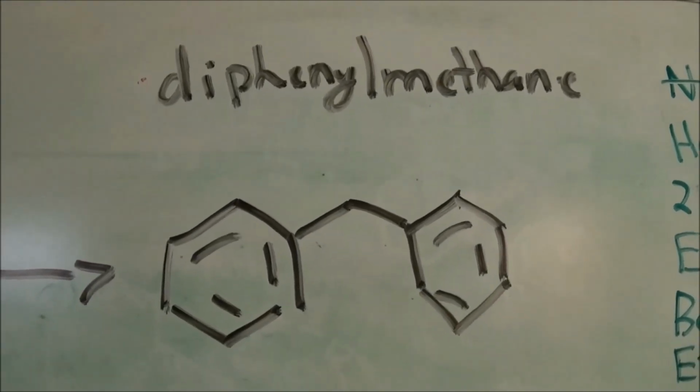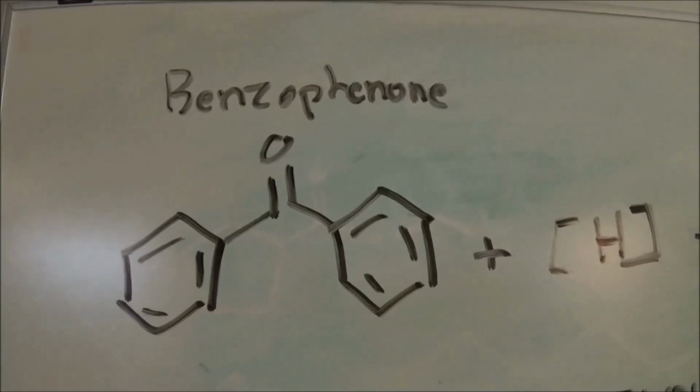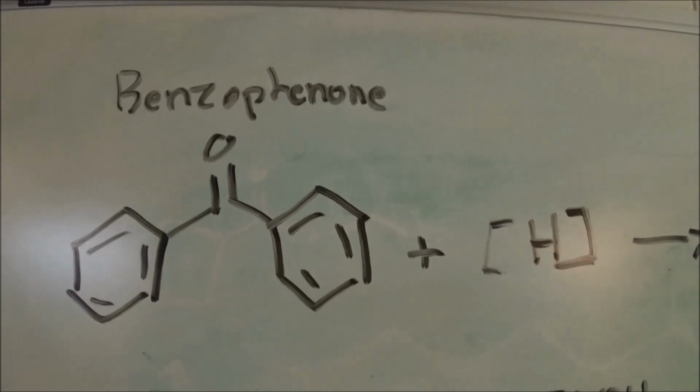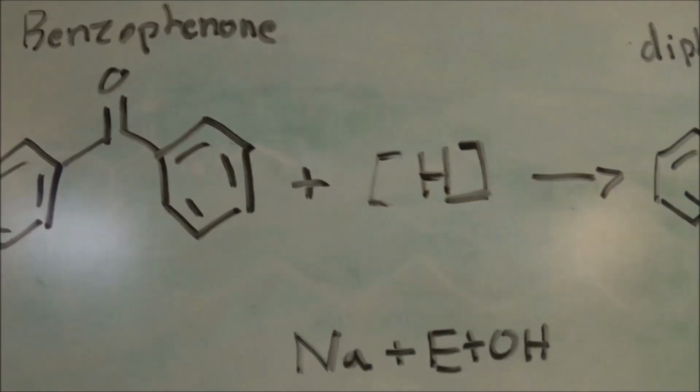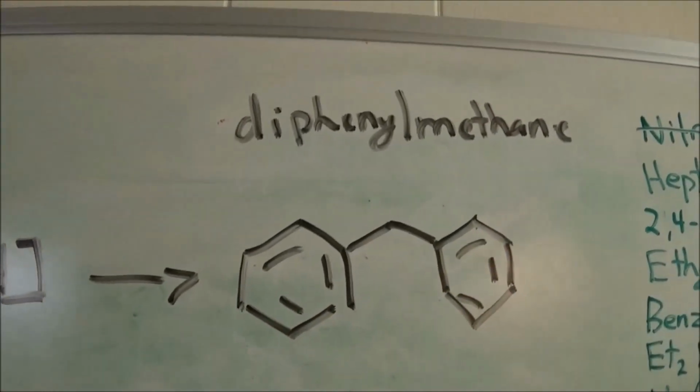In this video, I will prepare diphenylmethane by the reduction of benzophenone. The reducing agent will be sodium in ethanol, which reduces the aliphatic part of the molecule.